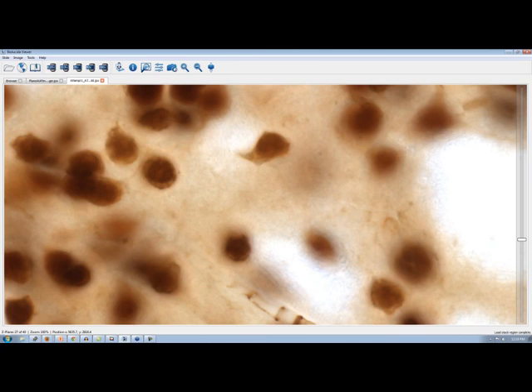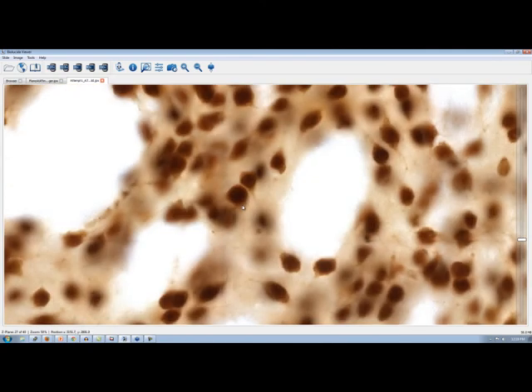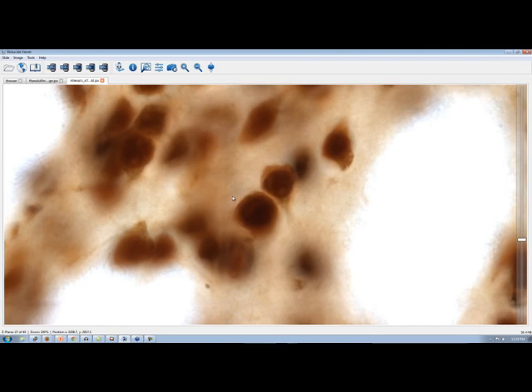And that's so fast. Now, you said this was a 50 gigabyte file, right? It's 50 gigabytes, but bear in mind that that's compressed at 20 to 1. Wait, so uncompressed, we have about 1,000 gigabytes, or a terabyte. Yeah, a terabyte of uncompressed image data for this one single image file. That's a huge file. But you've been moving around that image and focusing through the stack, and it's been going pretty quick. There's no way we've downloaded a terabyte, much less even 50 gigs, right? No, exactly. You only ever stream data that corresponds to the regions that you're interested in.